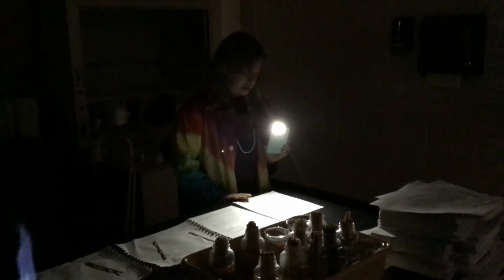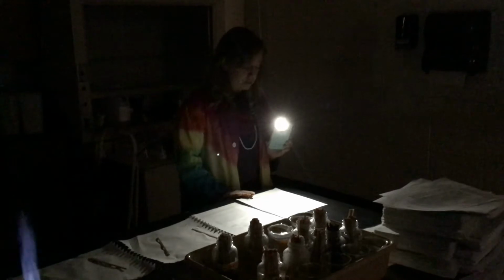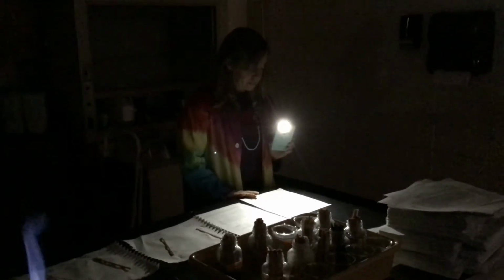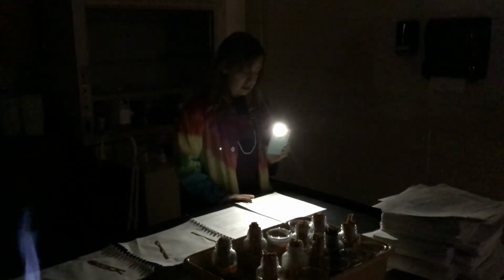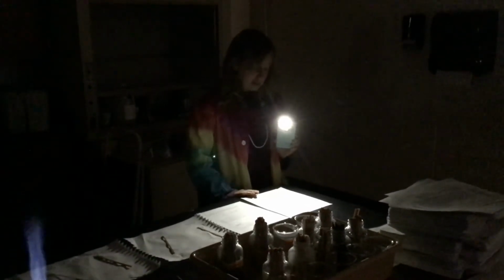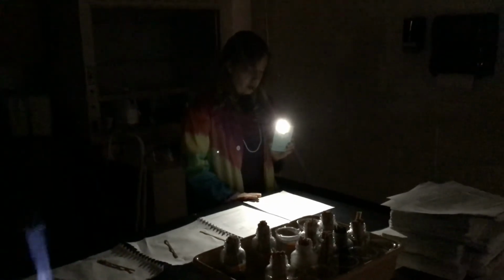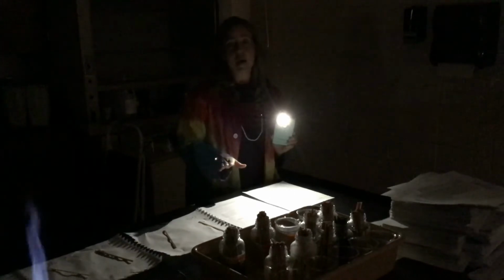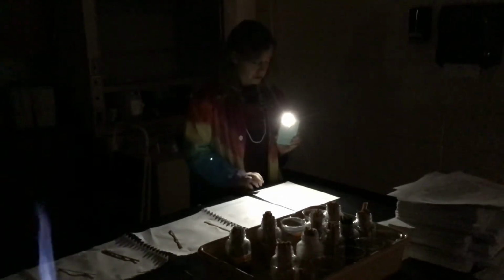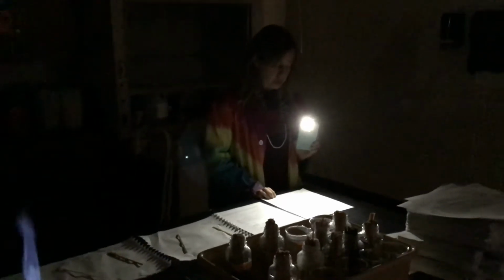These ions emit a unique color of light because they consist of atoms that have a unique electron configuration. Chemists can therefore identify these elements with a flame test. To conduct a flame test, we are going to take a wood splint that has been soaked in distilled water and is dipped into a powder, but what we did is we dissolved the powder in solution and soaked them in solution, okay? Then you place it in the hottest portion of the flame.